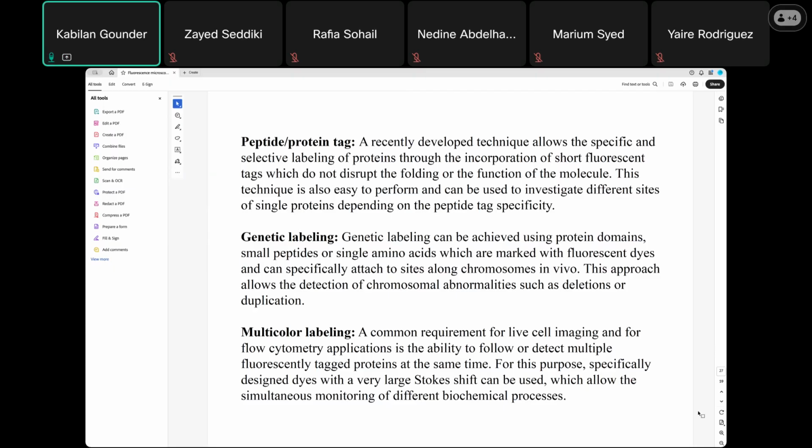So what you can do is, when you label these peptides, then you can go under the fluorescence microscopy. You will know exactly how this labeling, the cell peptide, will go inside and where it binds.